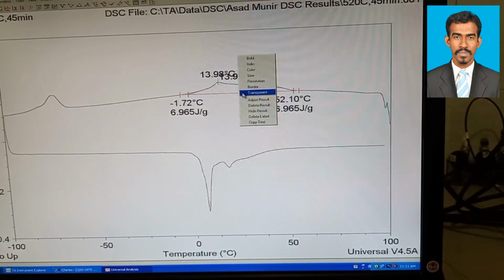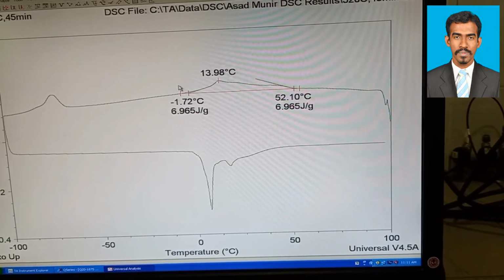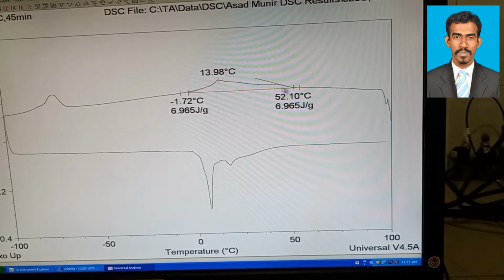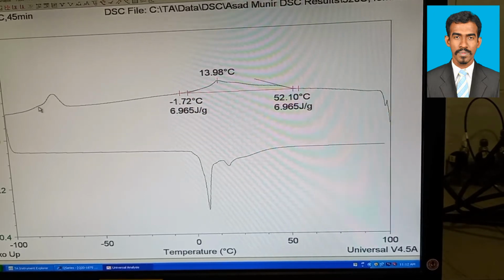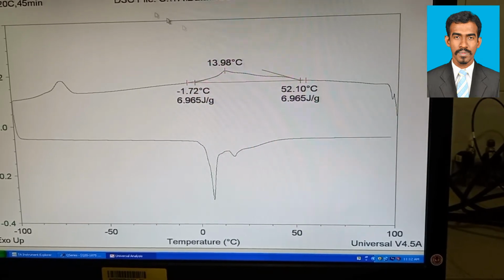One is overlapping, so delete one label. So we highlight our analysis of the Martensite, Martensite finish here. In the cooling curve there are 2 peaks, so we highlight 2 peaks similarly to this one.